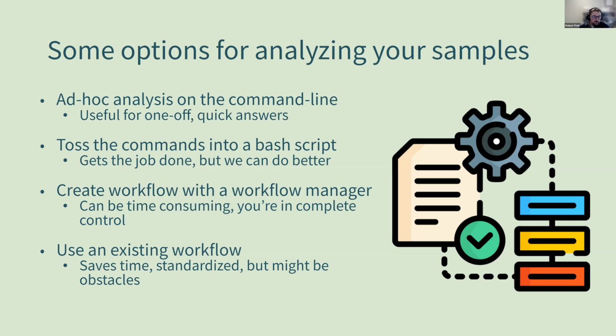And the final step in this is you can use an existing workflow. This will save time. It's likely going to be a little bit standardized just because it's being used by more people, so that it's settled on a few analyses. But there are some potential obstacles whenever it comes to getting something set up and running.